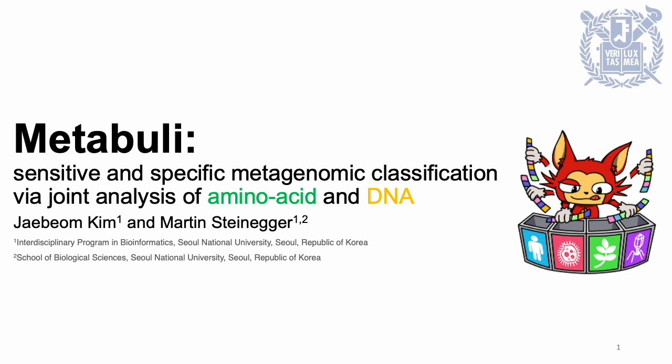I'm glad to present our new software, Metabuli. Metabuli is a sensitive and specific metagenomic classifier that jointly analyzes both amino acid and DNA sequences.